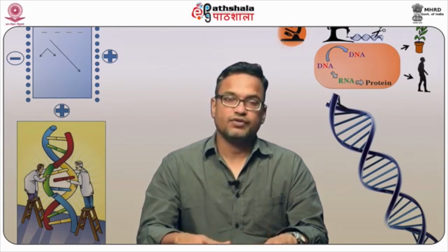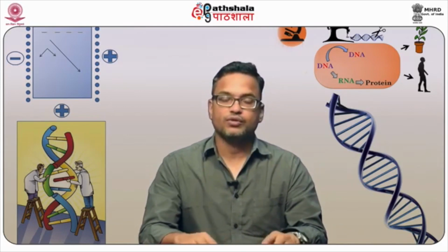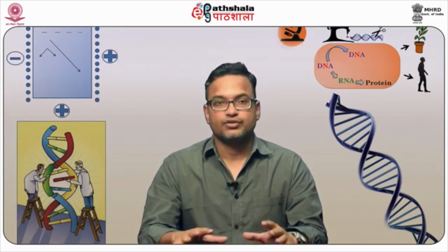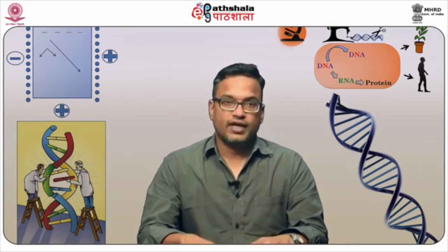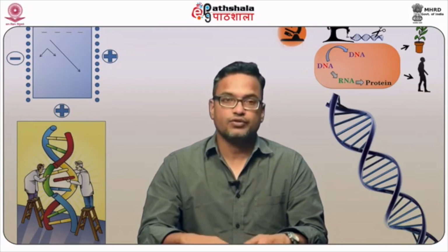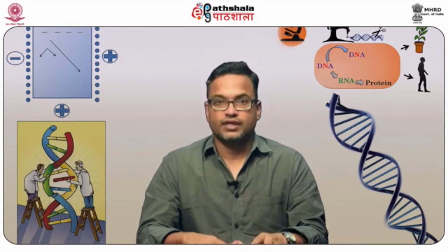Thereafter, techniques were used to make in situ hybridization more specific, to find out where within the cellular organization a specific protein, DNA molecule or specific structure is present in a cell. So they used antibodies, and as we know, antibodies are specific to the antigen. They used antibodies conjugated with fluorochrome or other available conjugates, so that once the antibody binds to the specific antigen, which is present exclusively in that localization, the non-specific ones were removed, and then by using a microscope or other techniques, they were able to localize specifically the organelles or the organization they wanted to study.